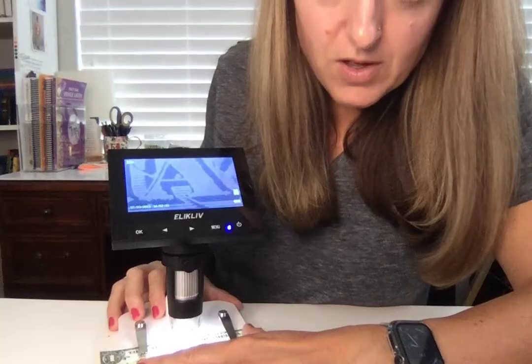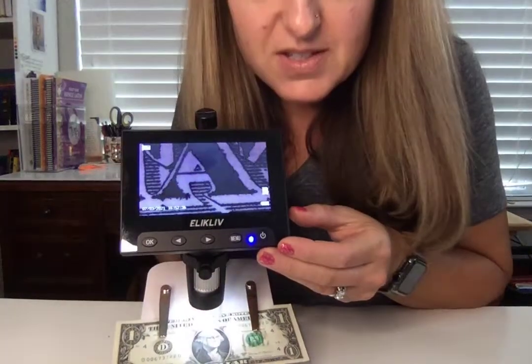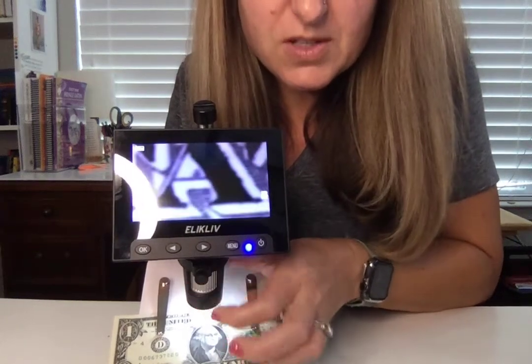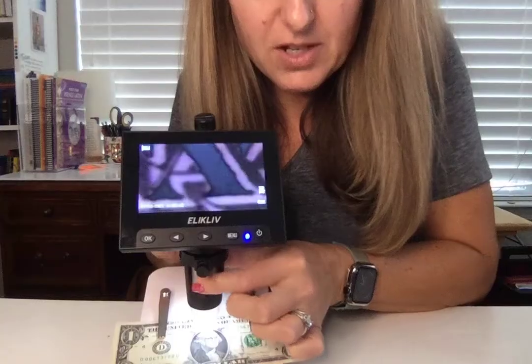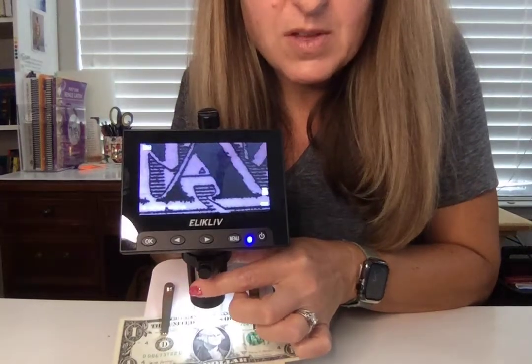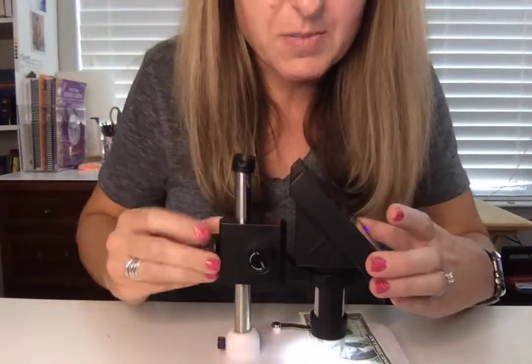Let's get it somewhere fun — right there. I'm going to point it toward you so you can see it really well. Now we can focus and unfocus using this silver knob down here. I'm just rotating it between my fingers and it's focusing. Also back here is a knob that, if I turn it, goes up and down.